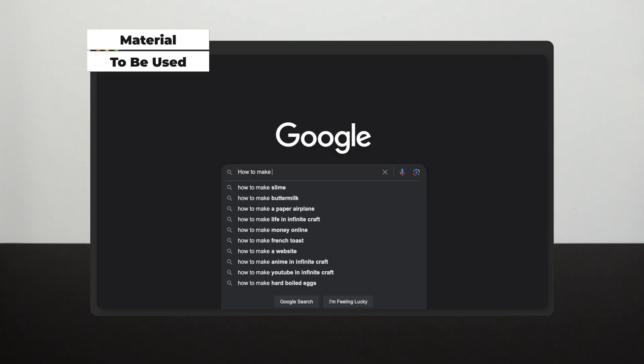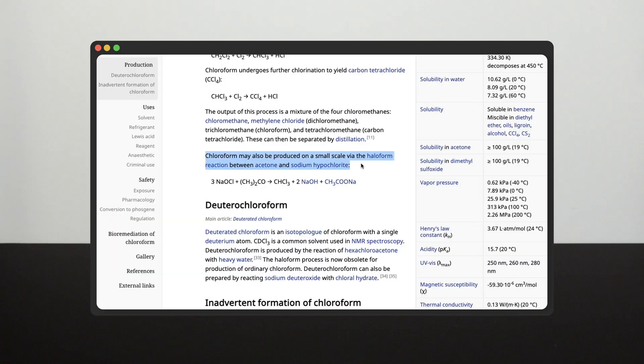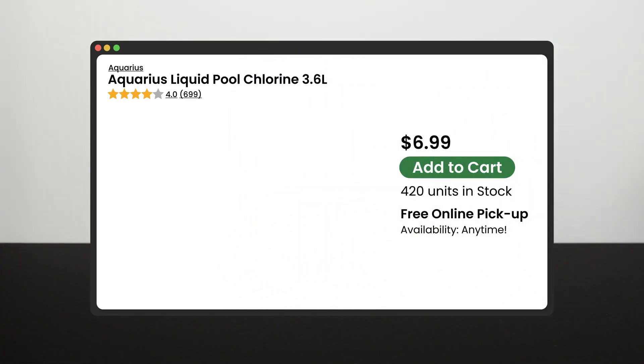Okay, so let's start making some chloroform. The main ingredients needed for this synthesis are surprisingly simple — you only need acetone and chlorine bleach. Basically, you can get them all on a single trip to a hardware store.